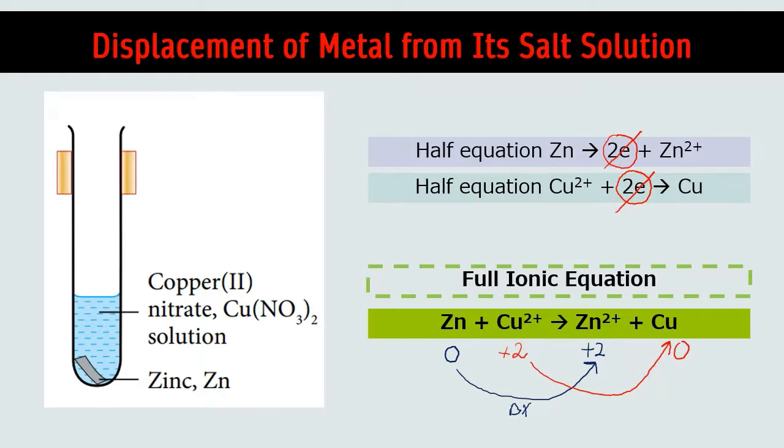It is confirmed that copper II ion undergoes reduction reaction. That is how we conclude the oxidation and reduction reaction in terms of changes in oxidation number.